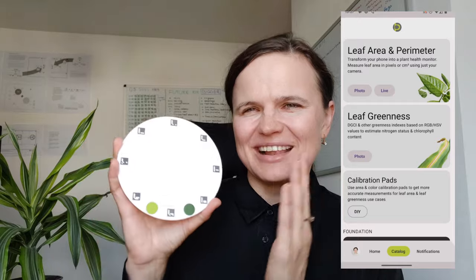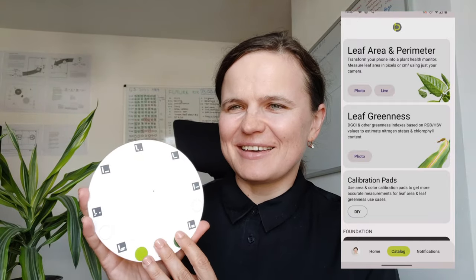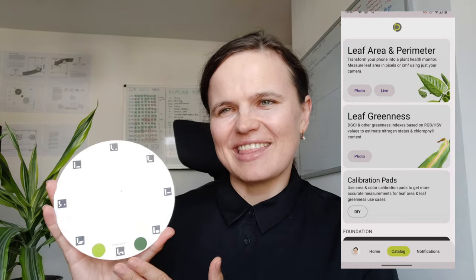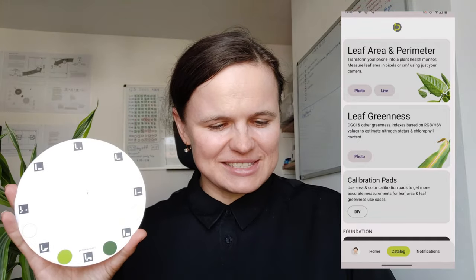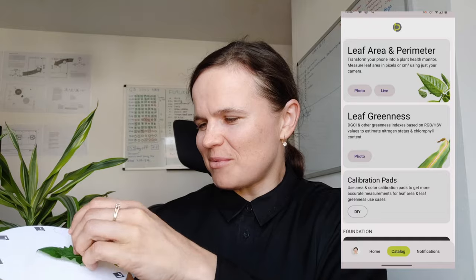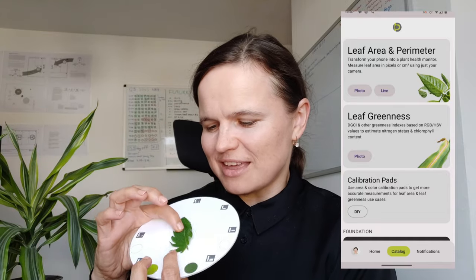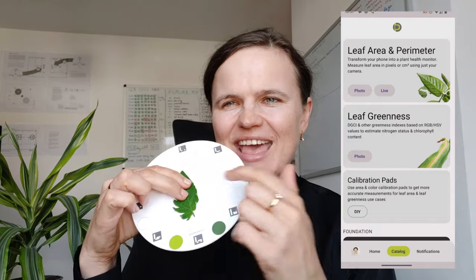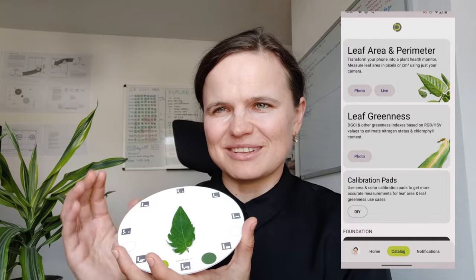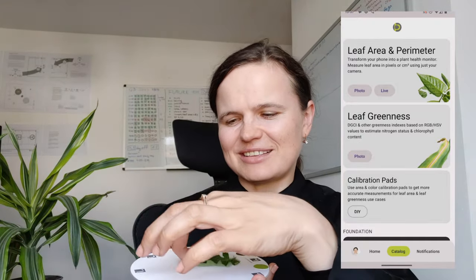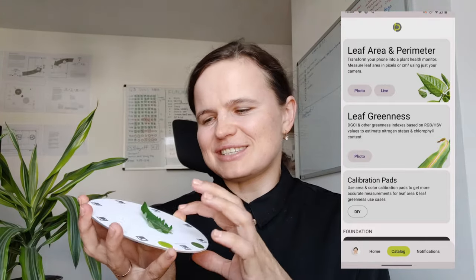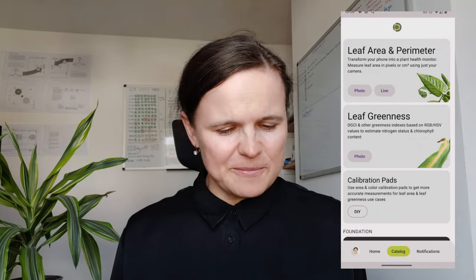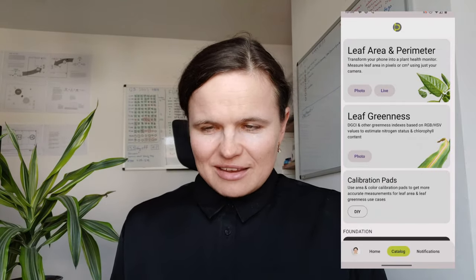Let's focus now on leaf area. For leaf area, you need only these black squares called markers — there are eight markers. Your task is to place your leaf on the white area and make sure that your leaf or any part of it is not covering any of the markers. All eight markers must be visible. If you are holding it in your hands, hold it like this and make sure all eight markers are not covered with any leaf. Then you need to take a photo.